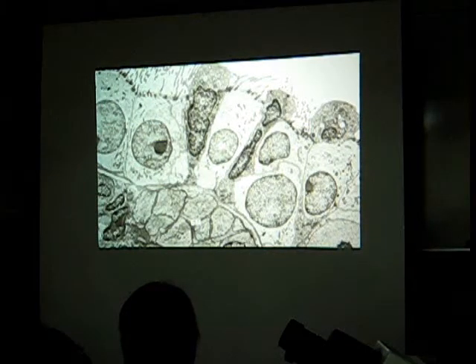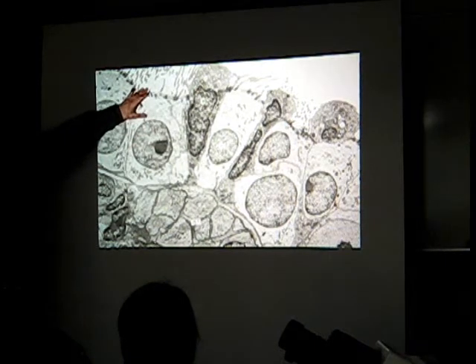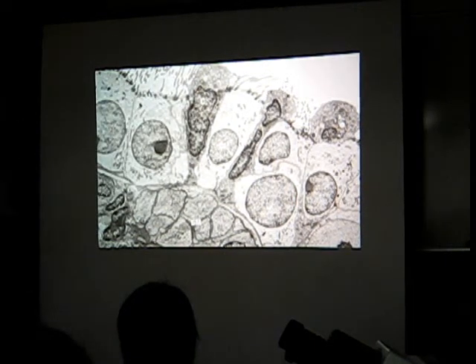Okay, I showed you this in lecture. We've clearly got a columnar epithelium that's ciliated still. We've got these Clara cells that crank out that proteinaceous substance that prevents the bronchiole walls from sticking to one another on expiration.